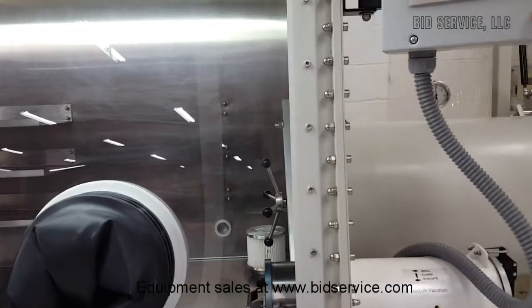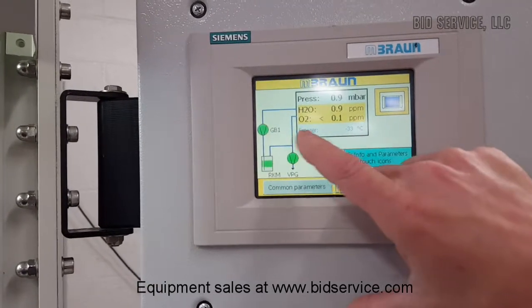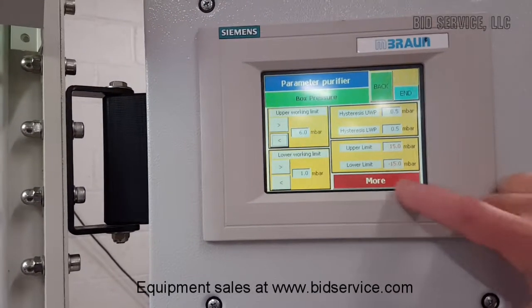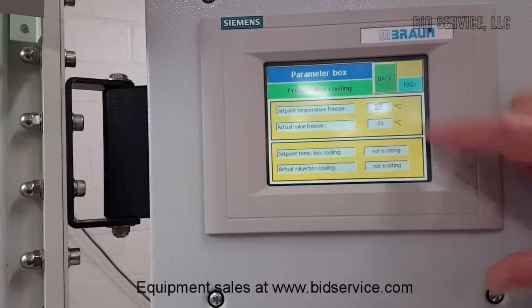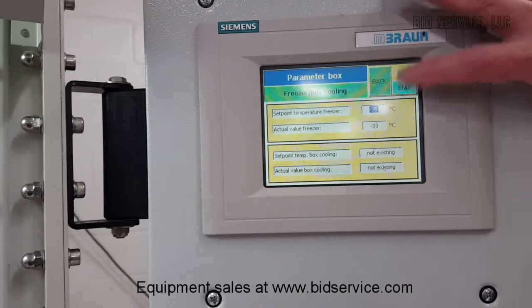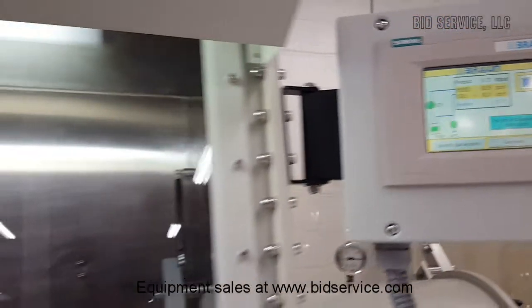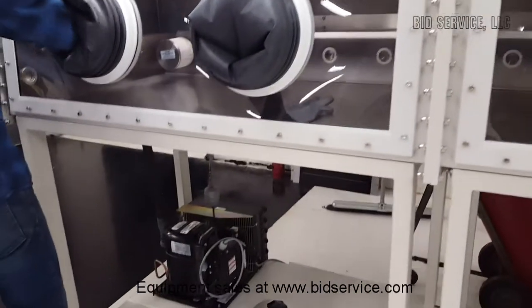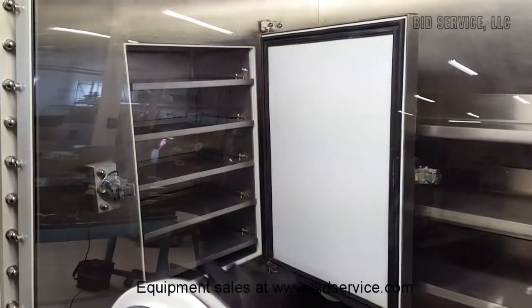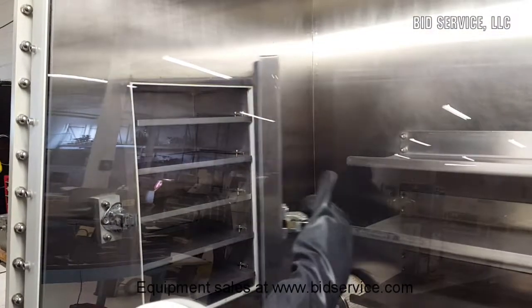While we're waiting for that, I just want to show you — we have a freezer, and the temperature is set at minus 35 right now. Here is where you would set your freezer temperature. Your compressor is down here for the freezer. I'll just open that up — you have a few shelves in there. It will go down to minus 35 Celsius.